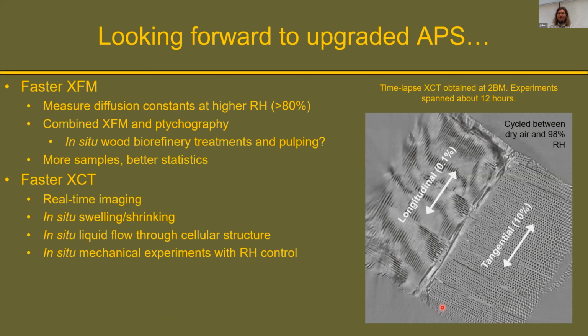So looking forward now to the upgraded APS. Of course, like Olga mentioned at the beginning of this session, we're looking forward to being able to do faster experiments. In terms of XFM, we're limited in how high a humidity we can go to given how fast we can do the imaging. So it'd be great, with the upgraded APS, if we could go to higher humidities and maybe even try to make those measurements in situ under water saturated conditions.